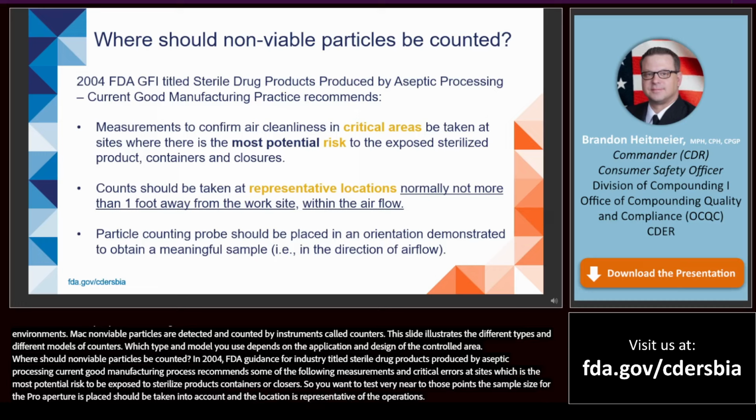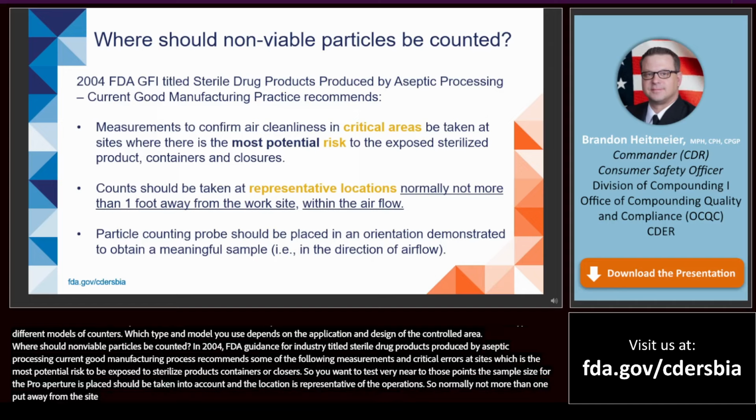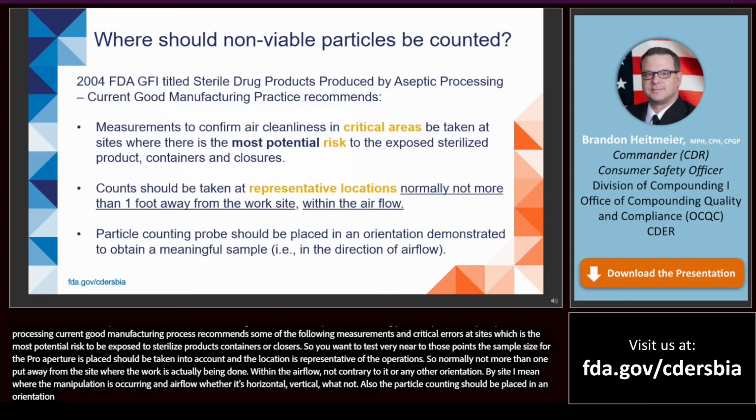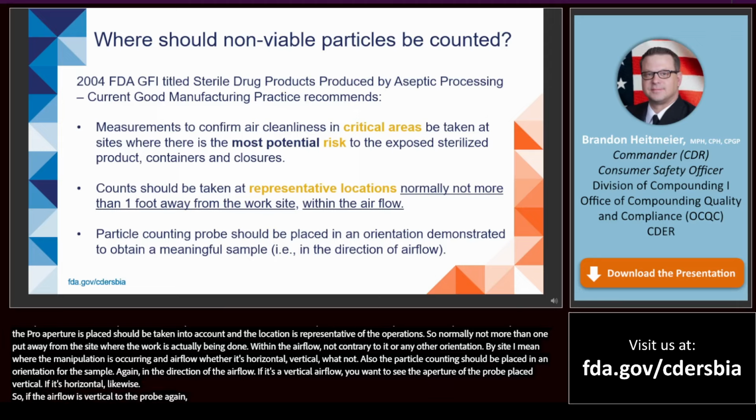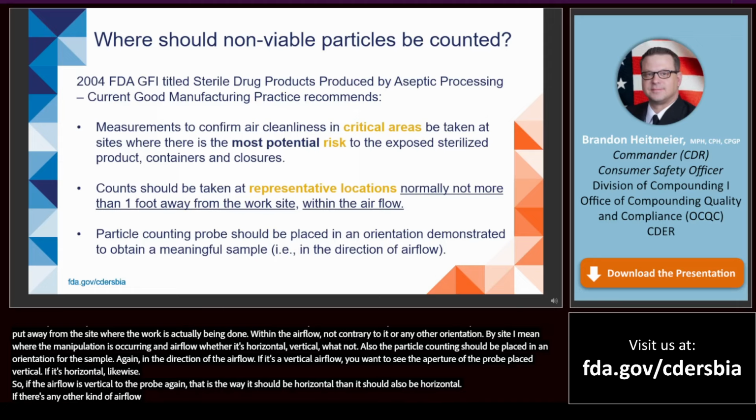So normally not more than 1 foot away from the site where the work is actually being done, and by work, aseptic work. Within the airflow, not contrary to it or against it or any other orientation. By site, I mean where the aseptic manipulation is occurring, and by the airflow is whether it's horizontal or vertical or whatnot. Also, the particle counting probe should be placed in an orientation that's demonstrated to obtain a meaningful sample. Again, in the direction of the airflow. If it's a vertical airflow, you want to see the aperture of the probe placed vertical. If it's horizontal, likewise. If there's any other kind of different airflow that I haven't mentioned here, that I'm not aware of.